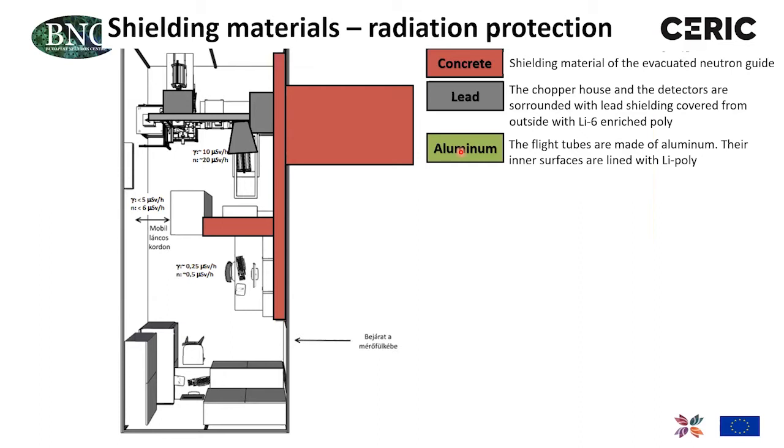So you should know that if you plan a neutron experiment, then you should be very careful with the material choices. If you place equipment into the beamline, this should be made of materials which do not get activated seriously, so that afterwards you can recover it. The most preferred materials are aluminum or Teflon. For instance, iron alloys with cobalt content should be carefully avoided.